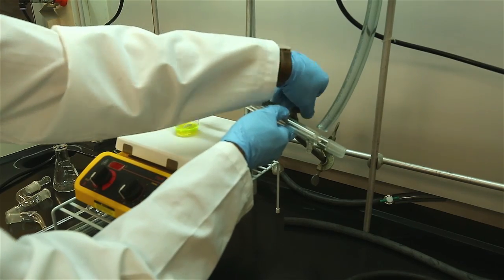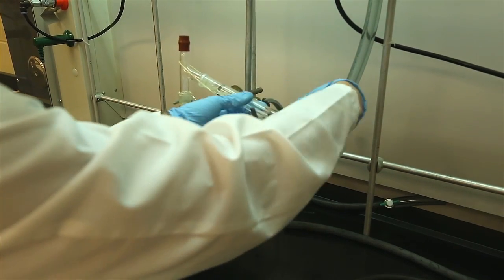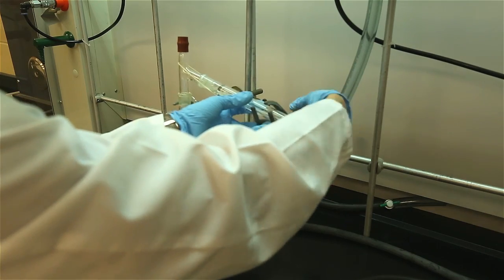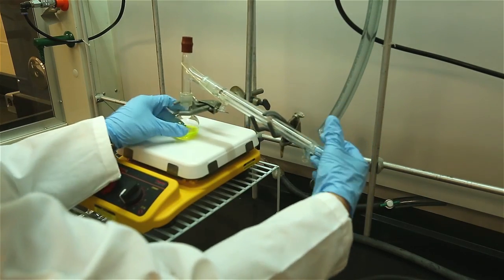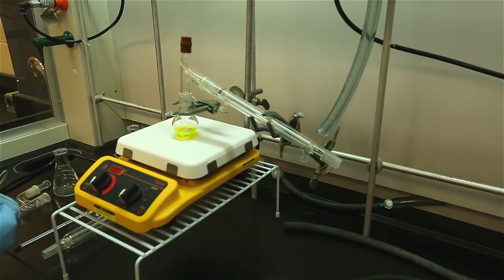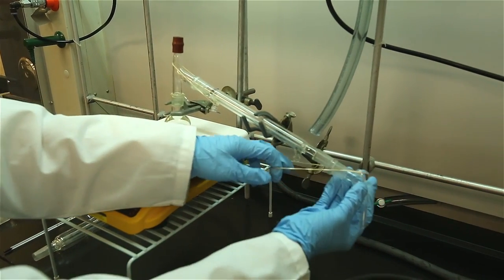For small volumes, you can use a small round bottom flask but place it into a water bath. The limitation here is that the boiling point of the liquid must be less than the boiling point of water. For higher boiling liquids, you need to use sand instead of water.